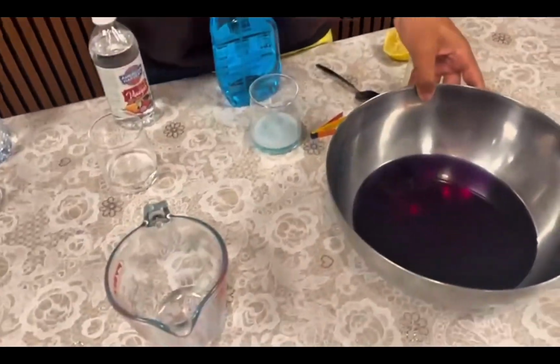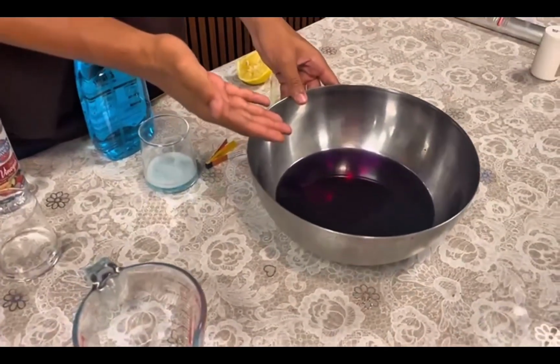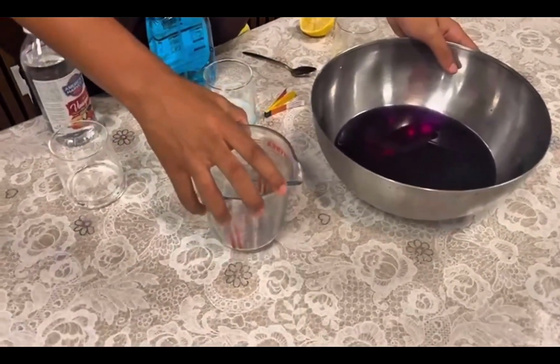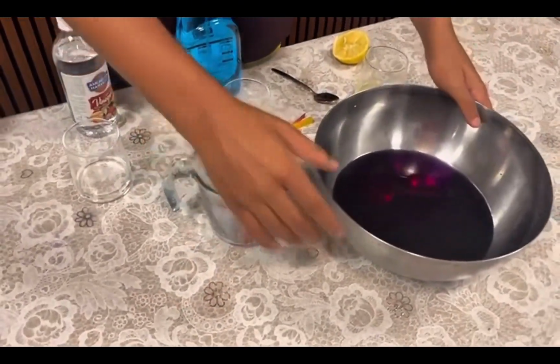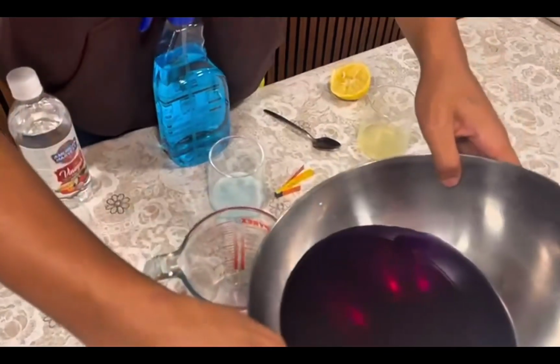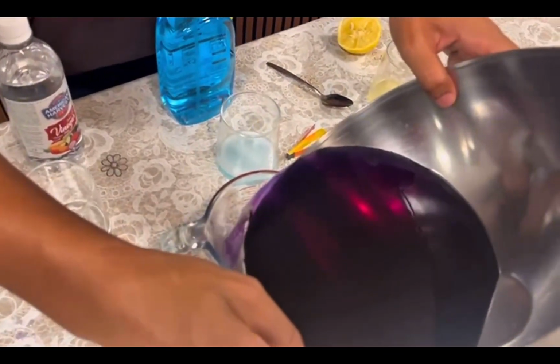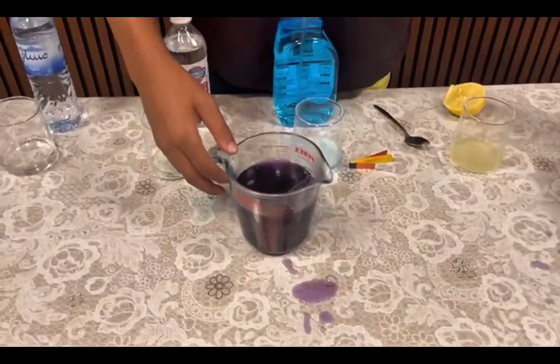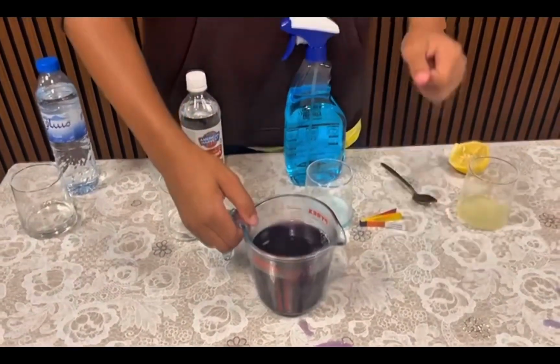Okay, let's start off, ladies and gentlemen. Let's start off with lemon juice. I have the components lined up as an example. Okay, we're going to be pouring the cabbage water into the beaker so it's easier for us to pour. Of course, spilled a bit, but that's okay, no worries.